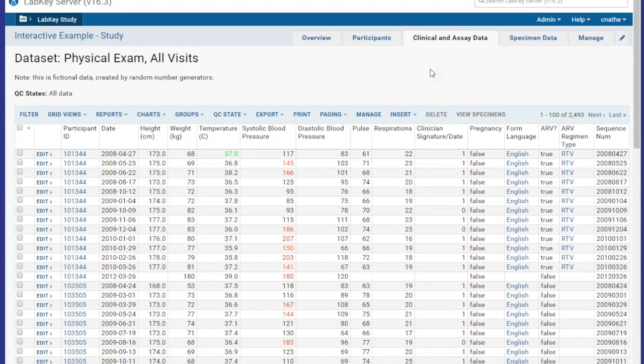Visualizations are a good way to explore data and see relationships between variables or get a sense of the distribution of data in a LabKey data grid. Prior to the 16.3 version of the LabKey server, the main charting wizard in LabKey had the ability to create box plots and scatter plots from data regions in LabKey.